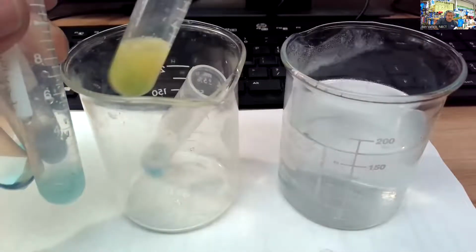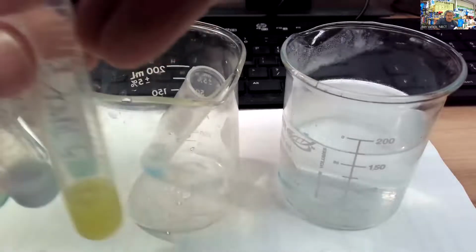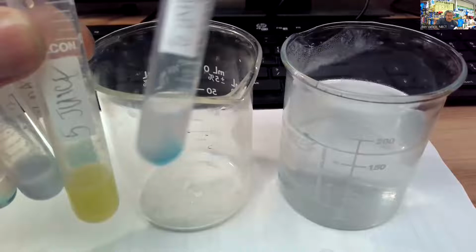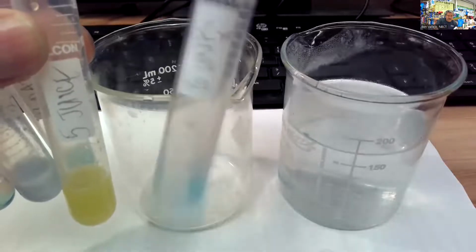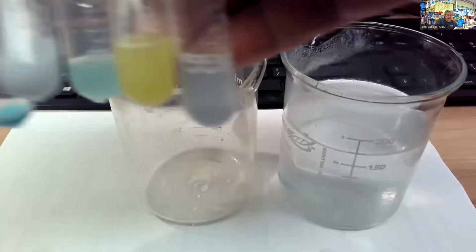5th one is your juice. Okay, mixing that up a little bit. And the last one is the unknown solution, the unknown X. These are the initial colors for all 6 tubes here.